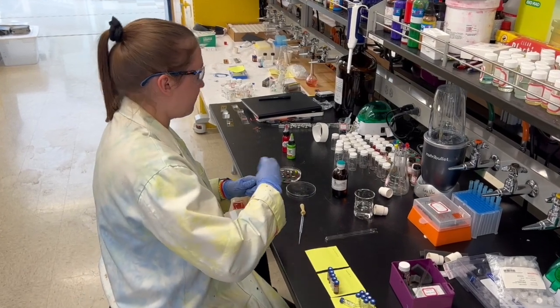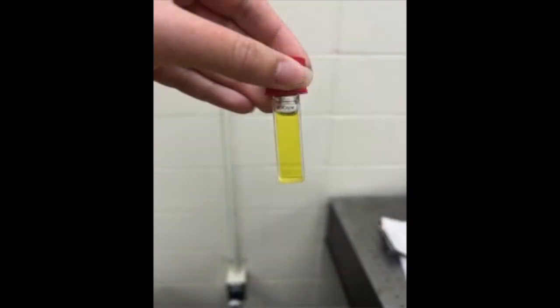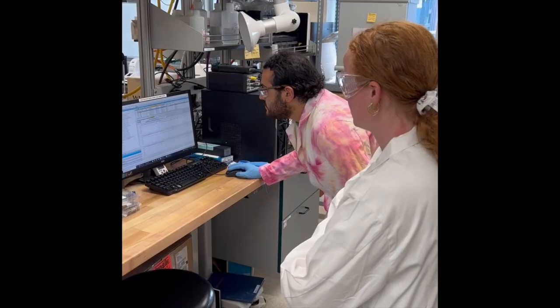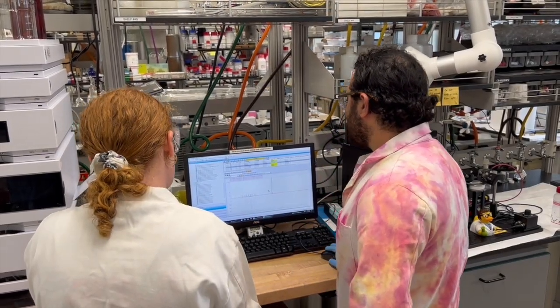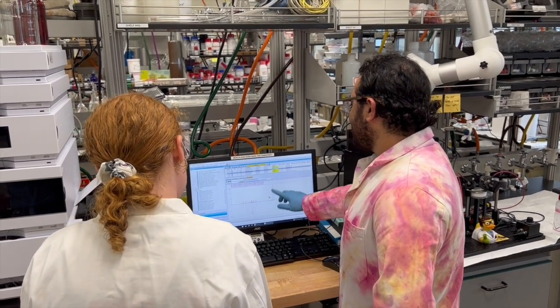Finally, we also use lasers to break down tattoo pigments by themselves. Here, you can see a sample of pigment yellow 74 that photodegrades into new, red-colored compounds when exposed to a laser. We can separate all the different breakdown products and use a variety of techniques like mass spectrometry and nuclear magnetic resonance spectroscopy to determine what the breakdown products are and if they pose a potential risk to human health.